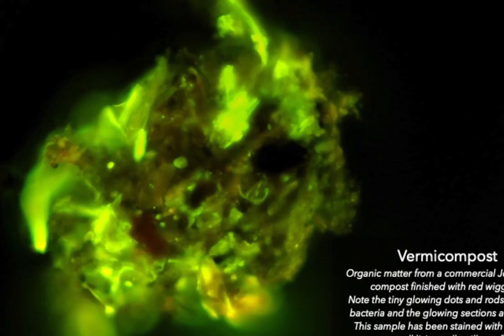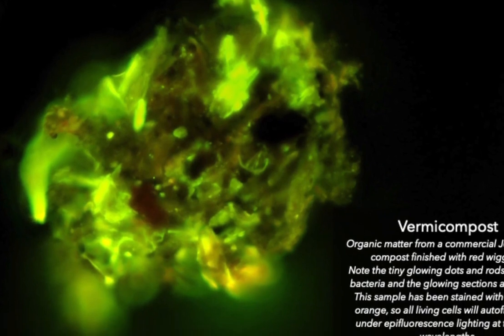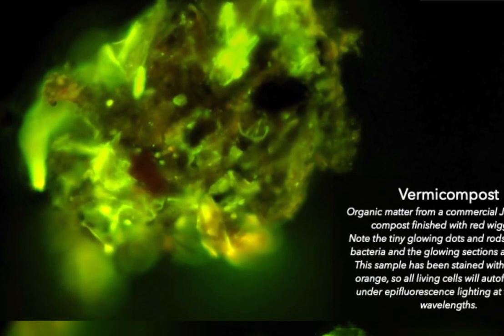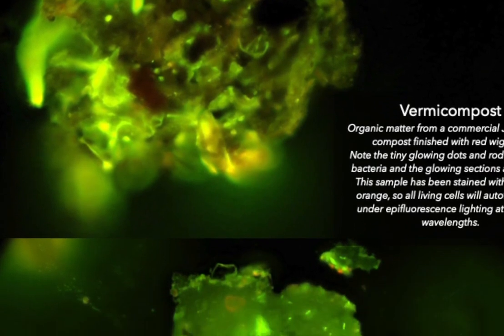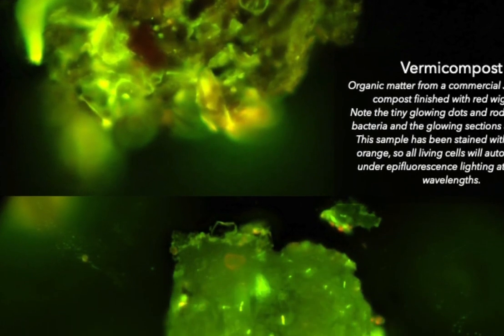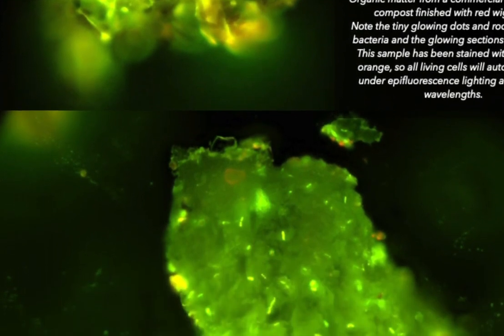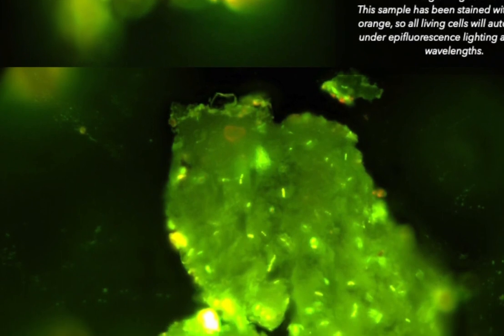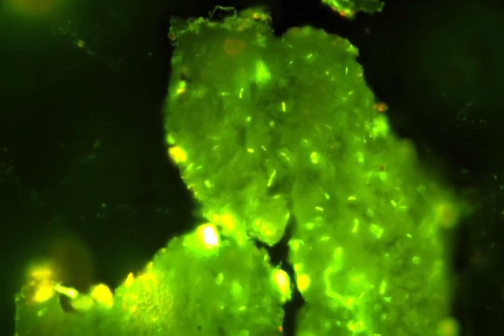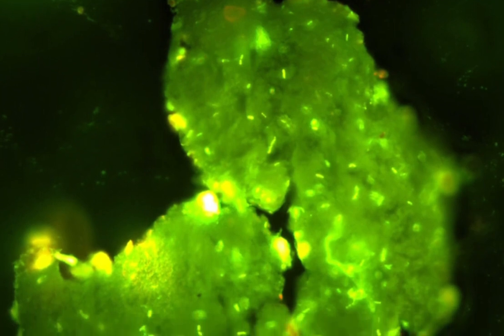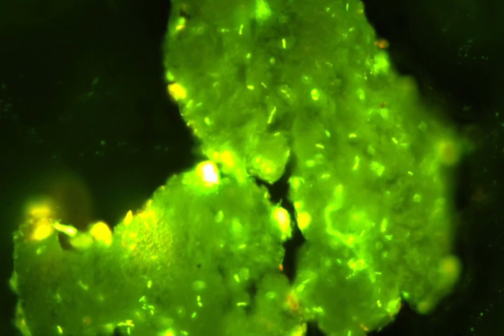These are images and you can see how beautiful and sharp it is. These are images from the epifluorescence lens. It's important to remember that the light is coming from above, not below, so we can look at the surface of things in a way that you can't with brightfield. You can see that those glowing dots are bacilli, right? You can see that some of them are conjugating, doing horizontal gene transfer here in real time. I love microscopy.